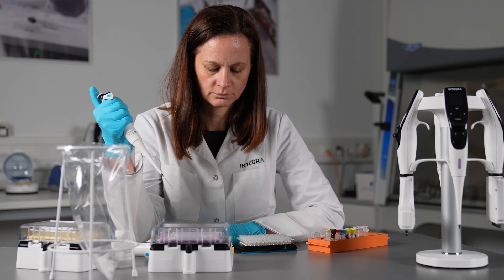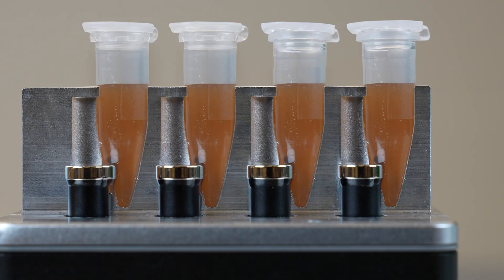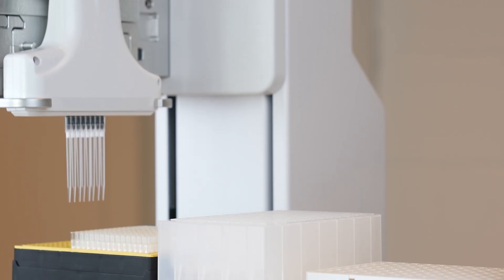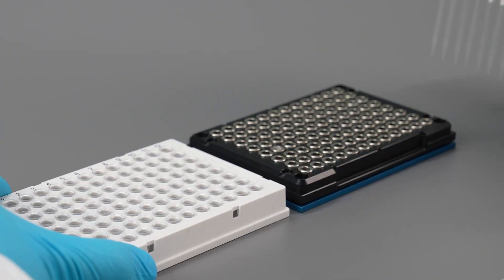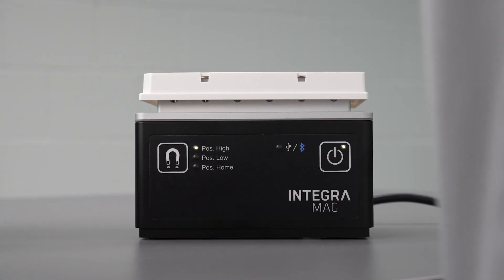However, manual purification processes in labs often prove to be tedious, highly repetitive, and error-prone. The Mag Modules enable automatic bead collection, streamlining magnetic purifications and enhancing workflow efficiency with seamless automation.